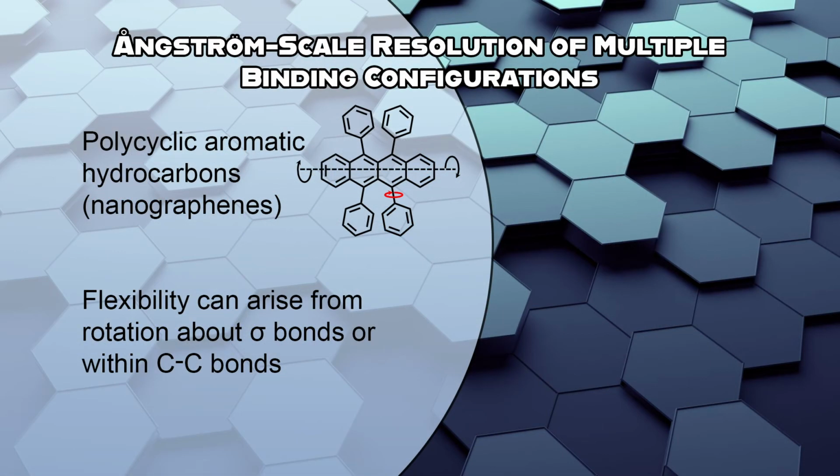Although the structure of sub-PC is rigid and remains unchanged upon adsorption, it is possible for the conformation of a molecule to change significantly when it interacts with a surface. Polycyclic aromatic hydrocarbons, or PAHs, have generated significant interest following the discovery of methods to fabricate nanographene on surfaces.